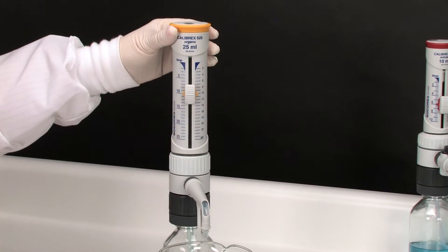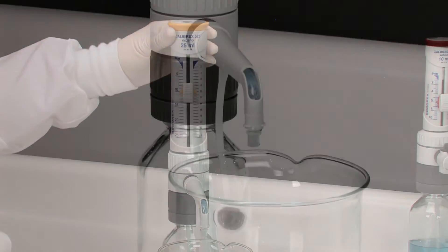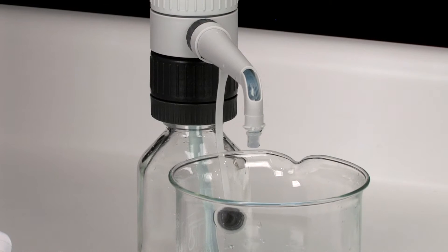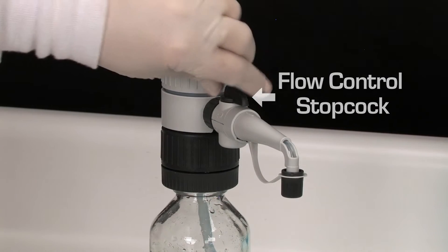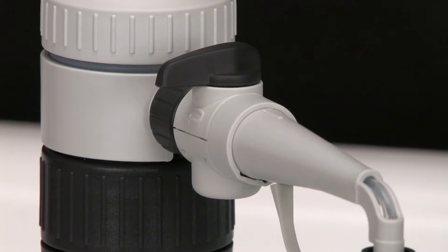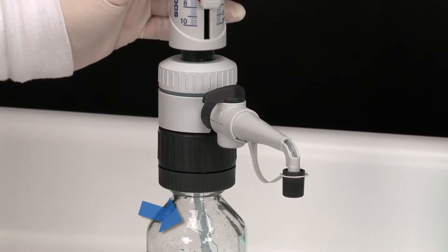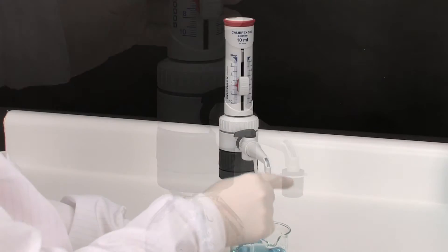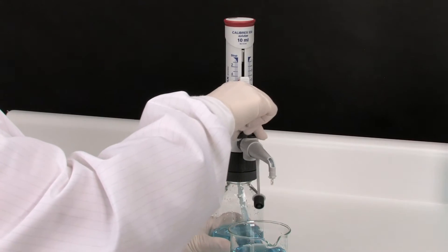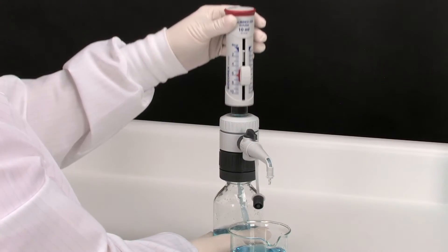Prime the dispenser until no air bubbles remain in the system. The transparent sleeve allows the user to visibly check for them. On the stopcock model, liquid can be returned into the bottle on the recycle position. When priming is completed, turn the stopcock to the dispensing position to start distribution.